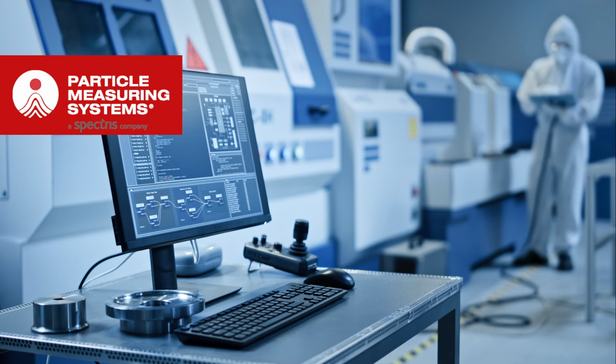There are some processes where a lot of individual sample points once per month reflects what's going on in a very stable environment. So why sample every day, or every week, or whatever that frequency is that the risk assessment puts forward.